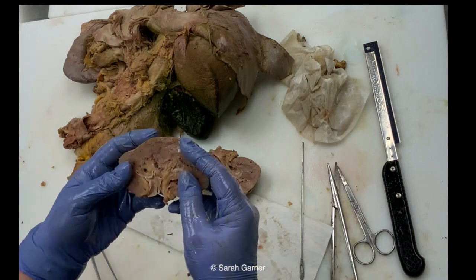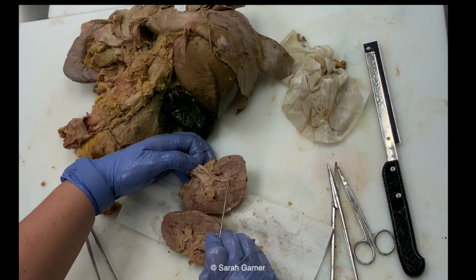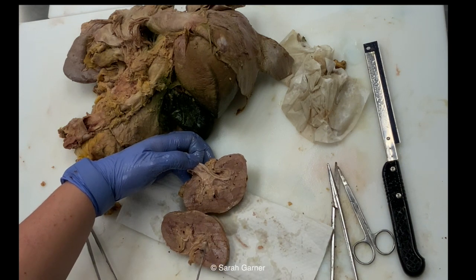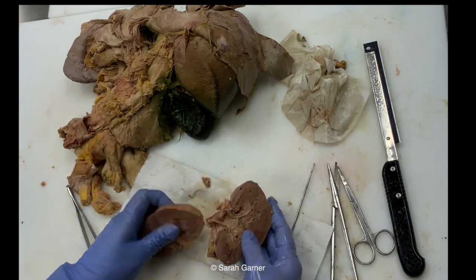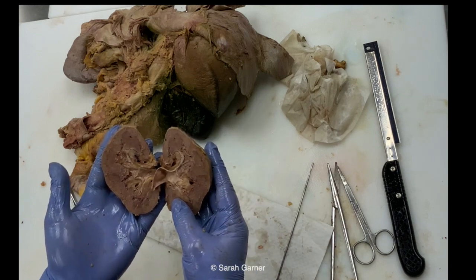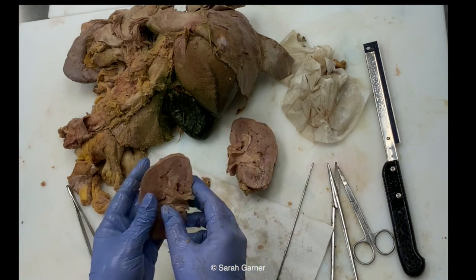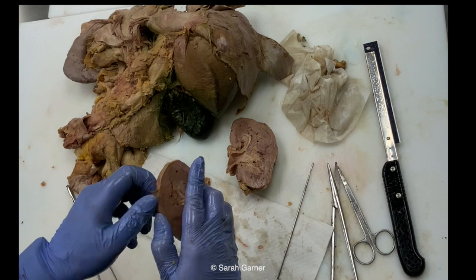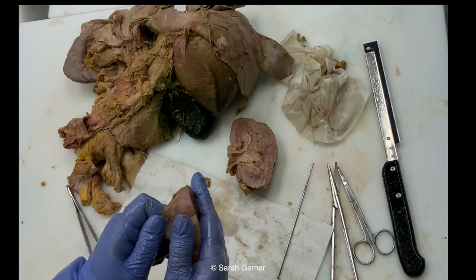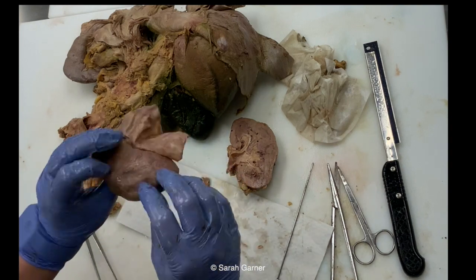So here we've got, on both sides, our renal pelvis. We've got our minor and major calyces. Same thing over here: minor, minor, major, major, pelvis, okay? So you'd want to fully inspect this. Maybe take a picture if you need to, measure your cortex if you need to, note any abnormalities, and then don't forget to peel off your capsule. So you can go ahead and do that. And again, you want to note whether it's easy or challenging to strip this, and then note the external appearance.